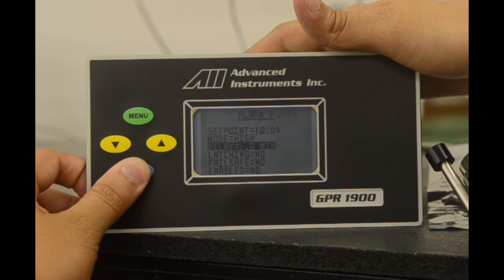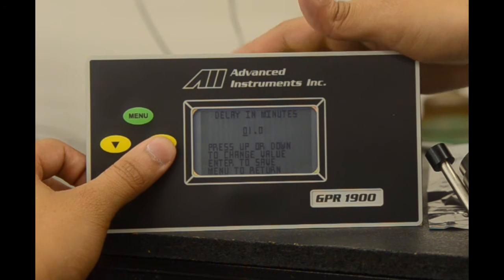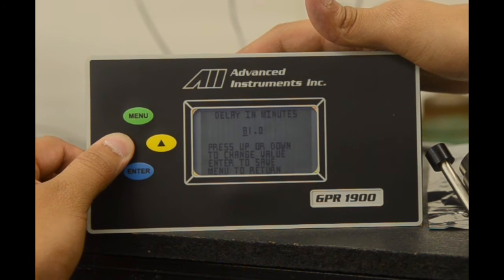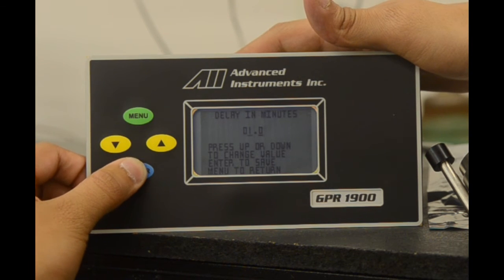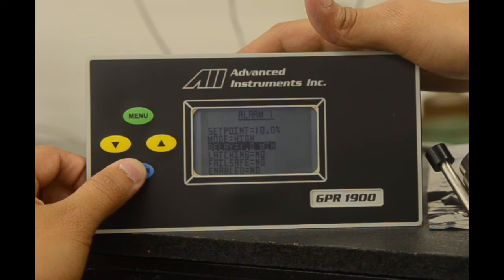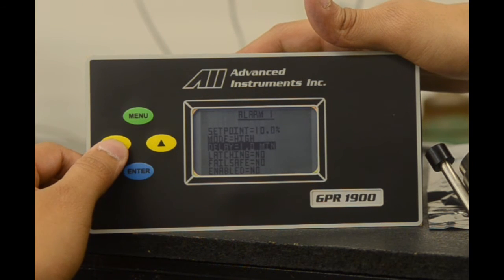We also have a delay function currently set at one minute. We select enter to change that value. The delay allows the analyzer to be under a certain alarm condition for the amount of minutes configured by the user before alarming. This is ideal to prevent false positives.